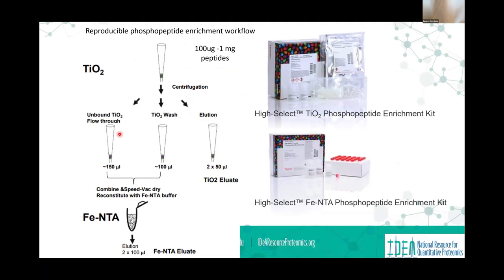One of the kits that we use, and I talk bad about Thermo more than probably most people that almost exclusively use Thermo products. But there are two kits, the High-Select titanium and High-Select iron phosphopeptide enrichment kits. And I had used these sometime back in the mid 2000s, and they were awful. Well, it just didn't work.